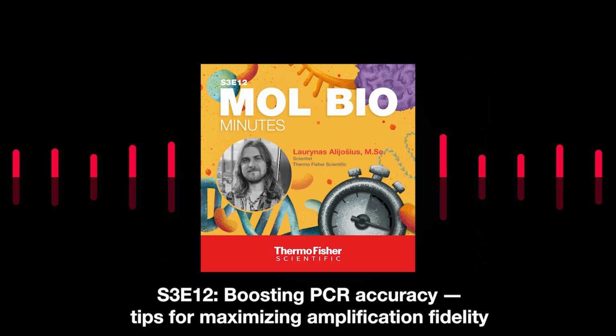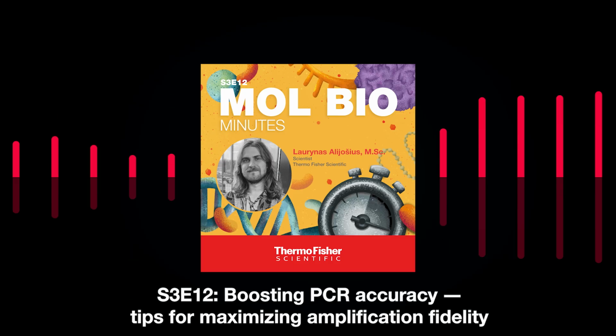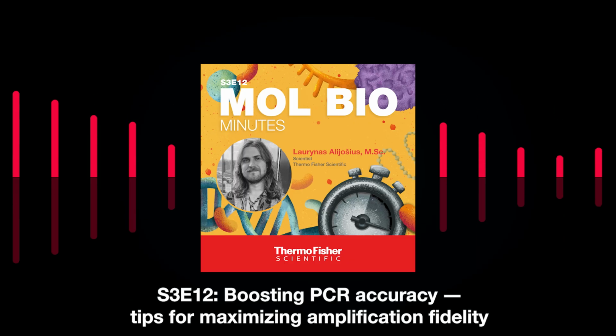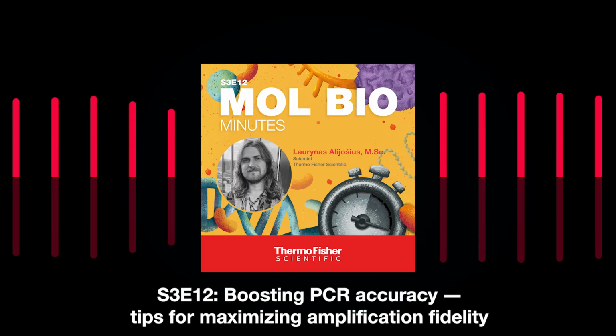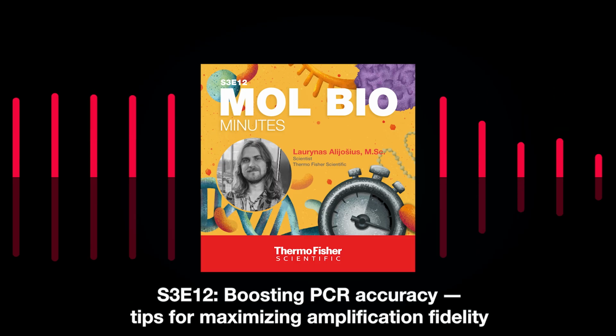As I suggested before, one of the major factors here for the PCR accuracy is the fidelity of your main enzyme, that is DNA polymerase. Fidelity is the thing that we call the accuracy of our DNA polymerase. So, for example, if we use conventional DNA polymerases like Taq DNA polymerase, they tend to have lower fidelity levels because they lack proofreading activity.